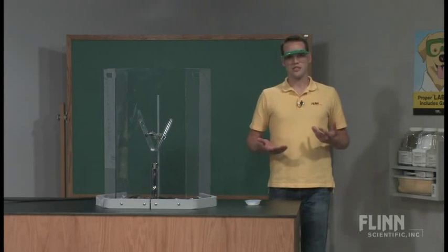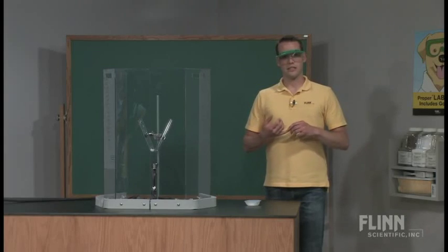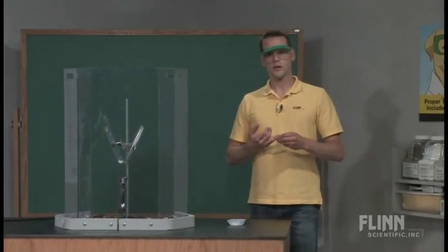There are several places that you can use this demonstration, but one of the interesting variations I found is that instead of potassium chlorate, you can also use sodium chlorate, and you can treat this as a demonstration not only to demonstrate classes of chemical reactions, thermal reactions, oxidation reduction reactions, but you can also tie it into atomic structure and periodicity and the flame tests.